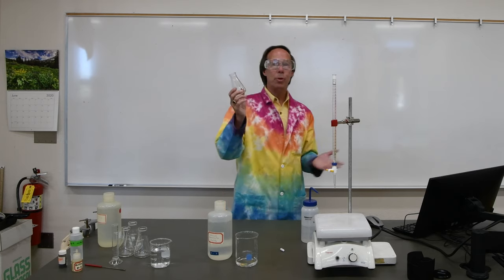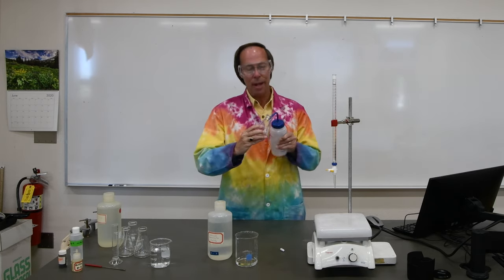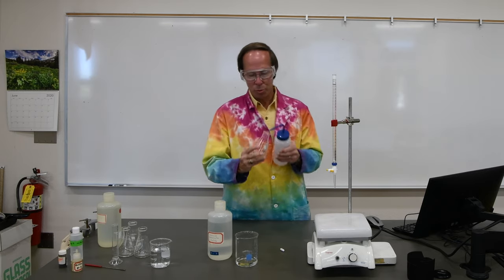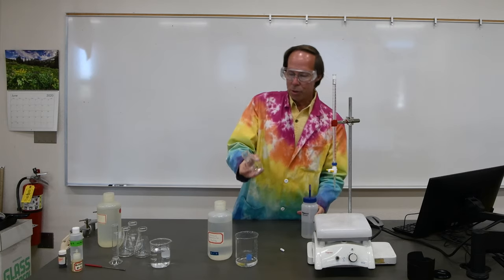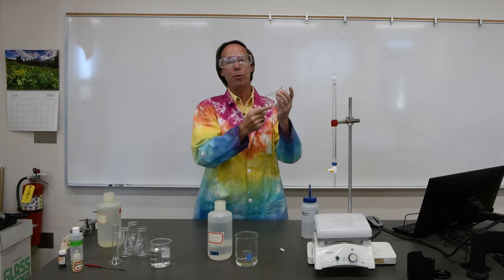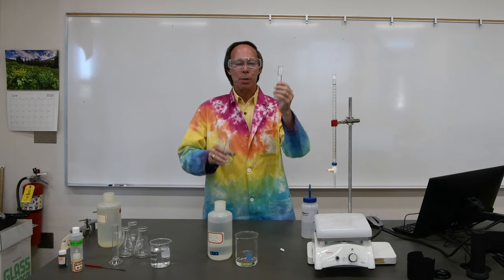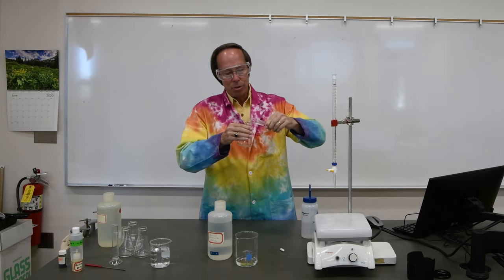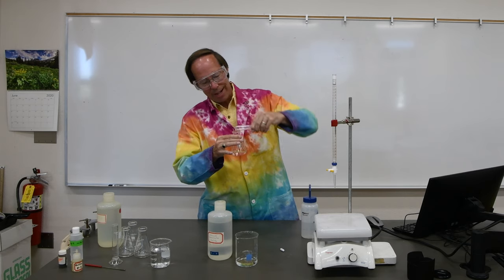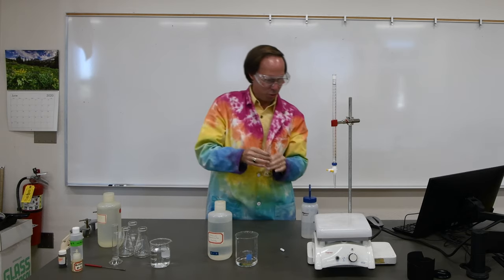Now the same problem we have with the flask is it might have contamination in it, so I'm going to rinse the flask out. We'll do that a couple of times with deionized water. Now the good news is it doesn't matter if there's extra water left in here because this water has no calcium in it. All we care about is getting all 25 milliliters of our test sample into the Erlenmeyer flask. Now when I pour it in, of course, I didn't get all of it in there because there's still some liquid in the bottom of the cylinder.